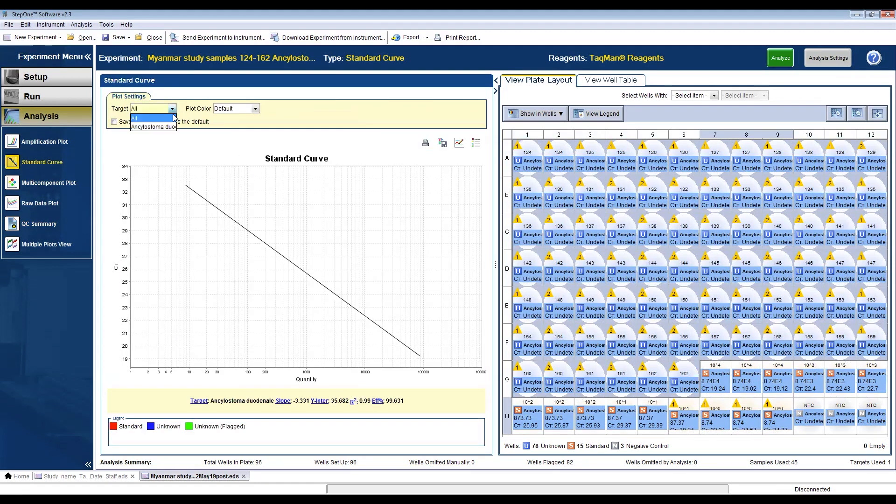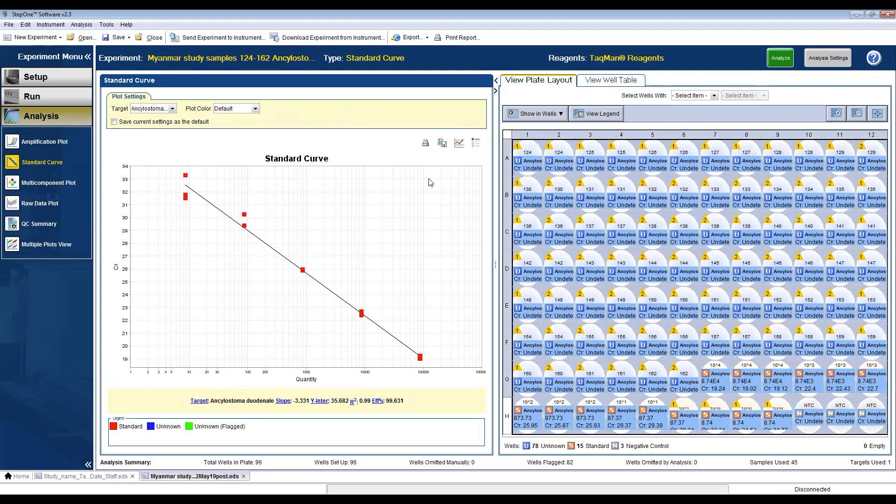Going back to the standard curve, your efficiency should be between 90 to 110 percent if the product is doubled after every cycle with no inhibition present.